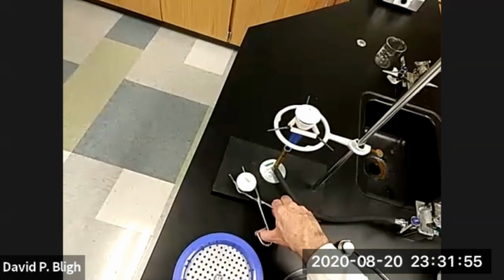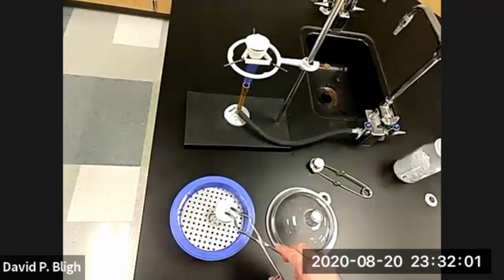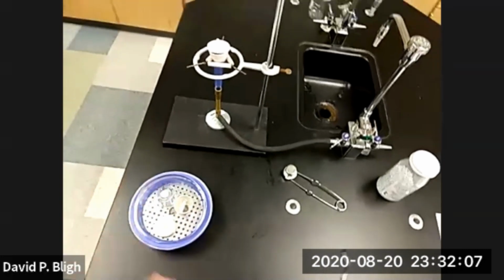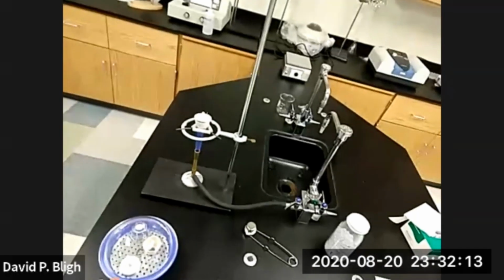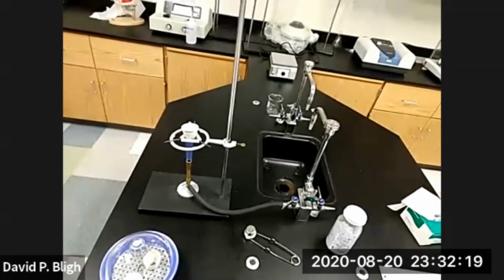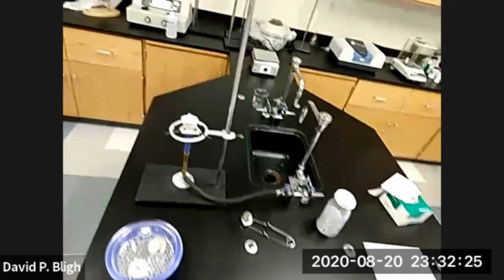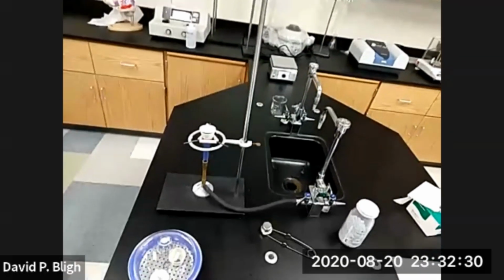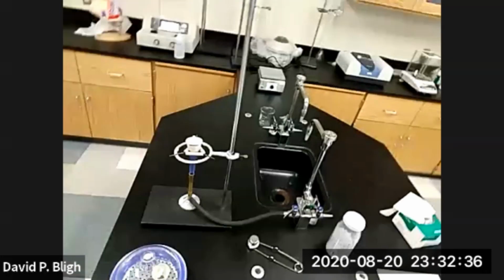Now we'll move it into our desiccator. There we go. And we're going to set the lid off so it'll cool a little bit faster and cover it. One rule is the only time you uncover your desiccator is when you have to put something in or take something out. The rest of the time, it must have the lid in place. Why? Because when the lid is off, the desiccant, the calcium sulfate in the bottom of that desiccator, is sucking up moisture from the surrounding air. If you leave the lid off, in no time, your desiccant will be exhausted.